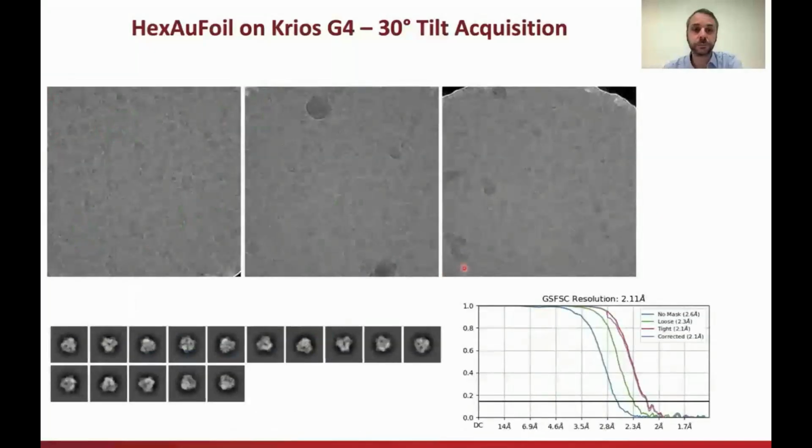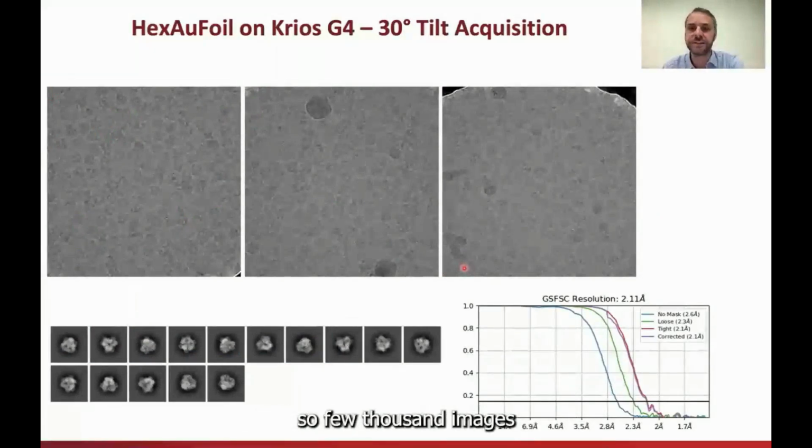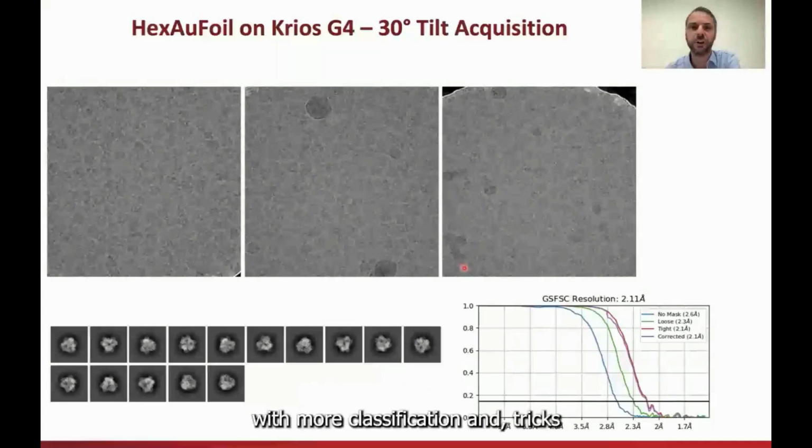After just overnight data collection, so a few thousand images, I could obtain, following the same processing protocol, a reasonable 2.1 angstrom resolution. I didn't push it. I guess I could most likely go below 2 angstrom with more classification and tricks here and there.